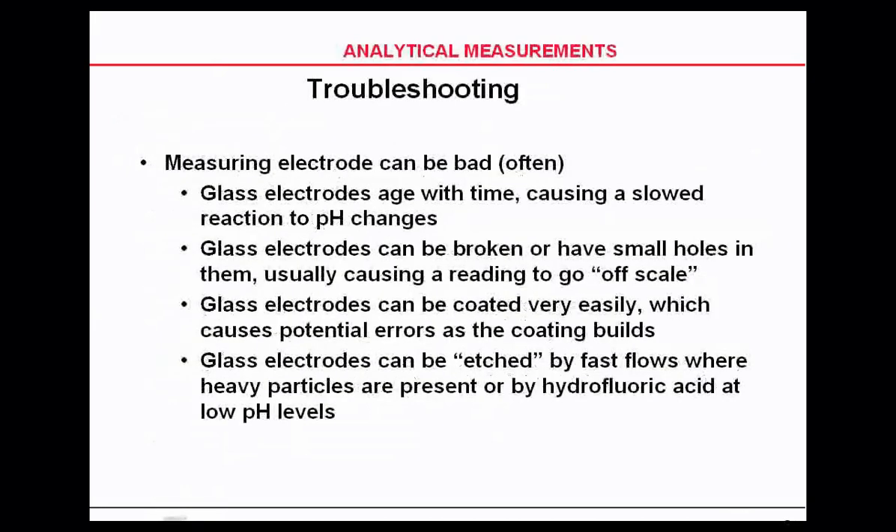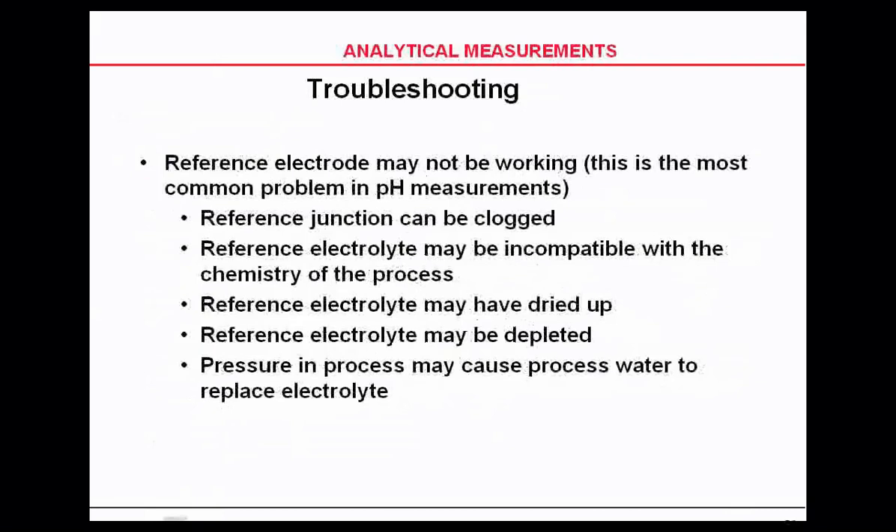Temperature has a major impact on measurement. Your measuring electrodes can be bad — they can be cracked, old, or dirty.